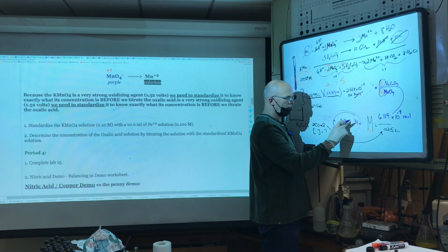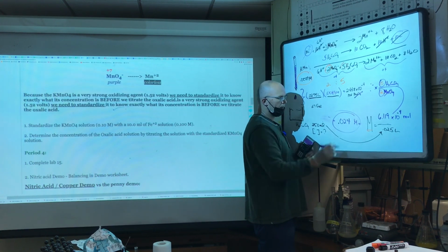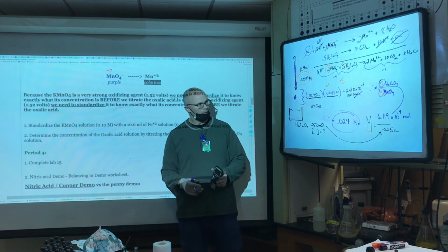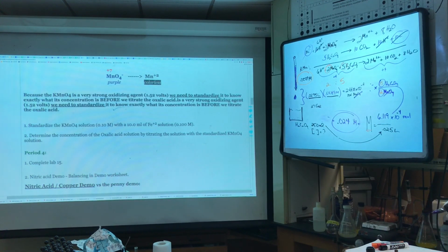Probably carrying two significant figures, so 0.024, sorry. What was my number? 245, 244, so 0.024. I made 0.025. Wouldn't it be 0.025? Because it's round up. It was 0.02447. Oh. So the other number, okay? So I made 0.025. We're getting 0.024. Not bad. I made that oxalic acid last year, so it could be degrading. Good number. Okay? Good number there.